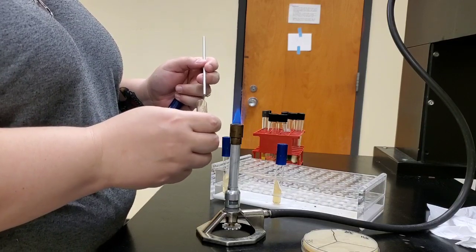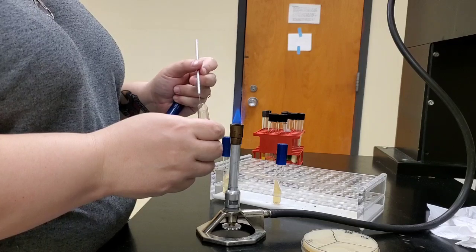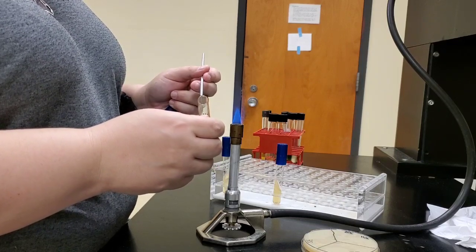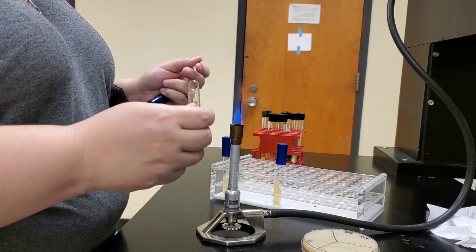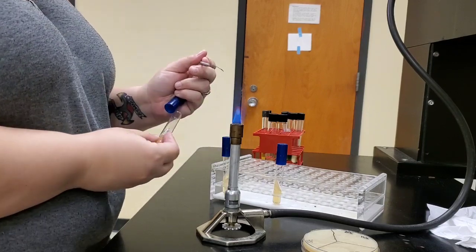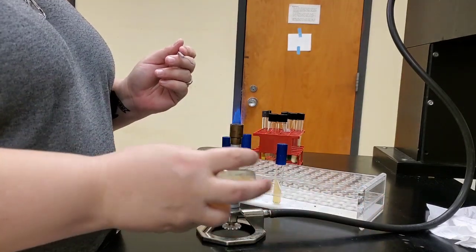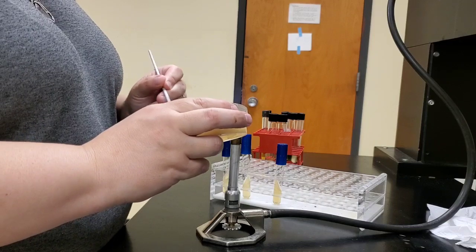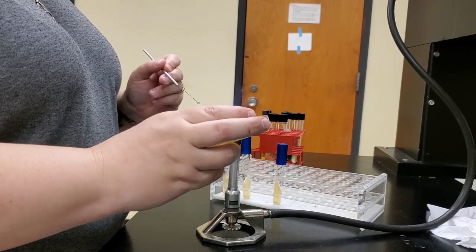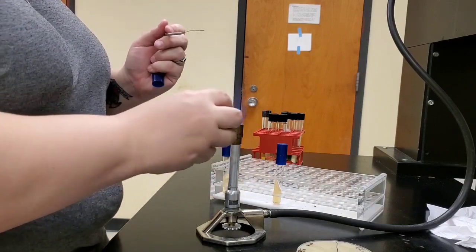Make sure your loop cools off. Obtain some of the organism. Inoculate the sector that's labeled for the organism.